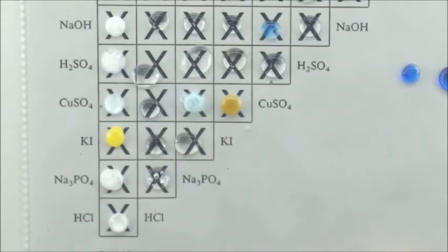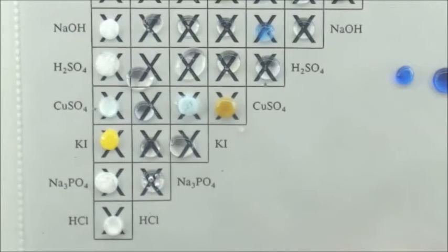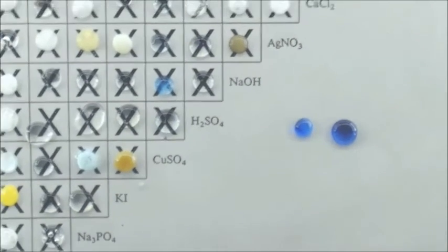Some of them shifted, but you can still see where they belong. That's an interesting little precipitate there. That bright yellow one's a nice one to work with if you happen to see that in your unknowns. But that orangish one's kind of interesting as well. All right, again, you can freeze frame that. Kind of pause the video if you need to at that point. There's a close look at those two. Precipitate, and then the precipitate dissolved, because yeah, they're pretty blue.